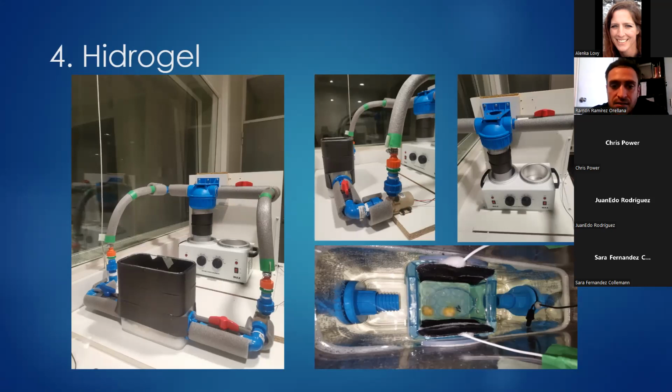También la temperatura está siempre controlada, y esto acortó bastante los tiempos de clarificado del cerebro.